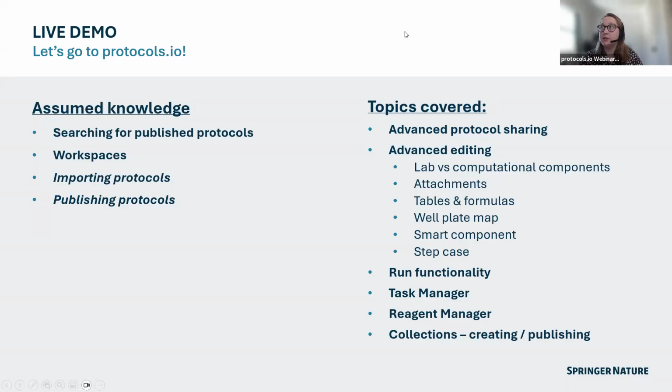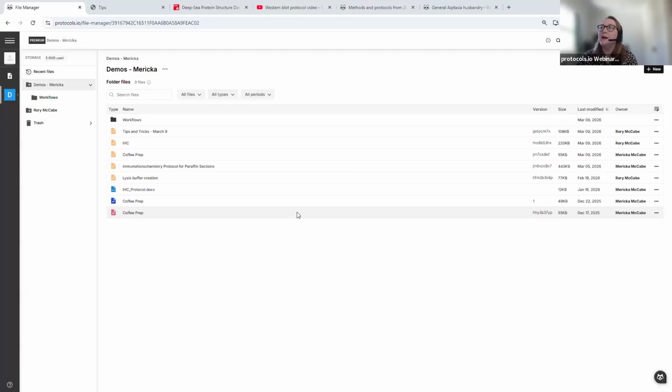So let me stop sharing for 1 second and we'll transition out of the slides and into the file manager. Okay, so we should now be in the file manager.